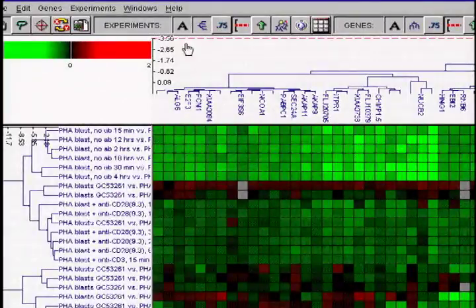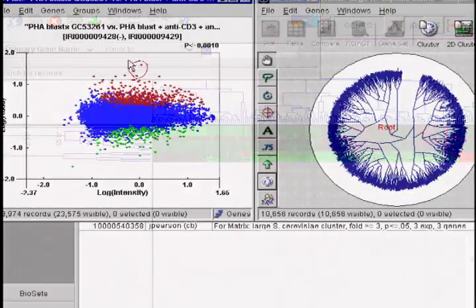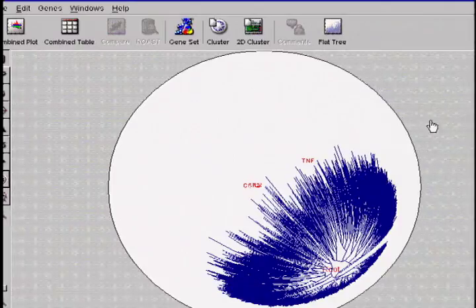When you use an array, you have 10,000 or more pieces of information coming back. And if you can't connect the information together, if you can't make sense out of it, you go in and pull out one piece or another, you're not really getting much value out of the array. So the bioinformatics is a way of actually filling in those gaps, making those connections, seeing things that tie various pieces of information together, and learning much more than the data, really turning it into the knowledge that's needed to do drug discovery.